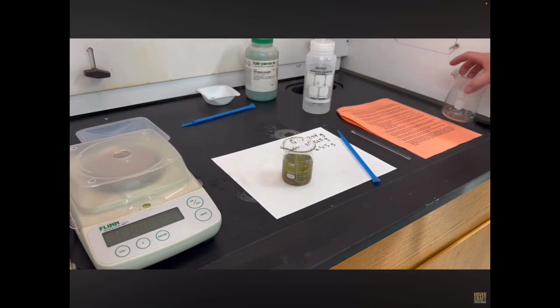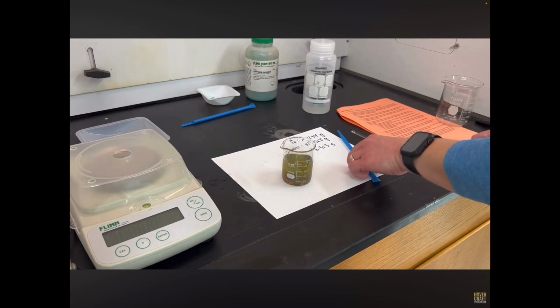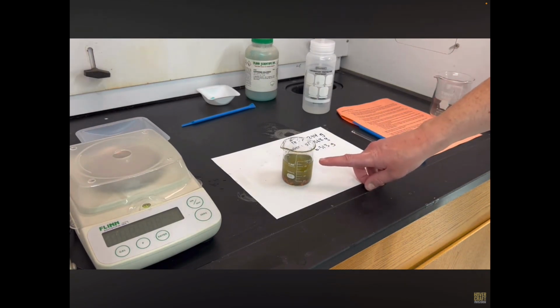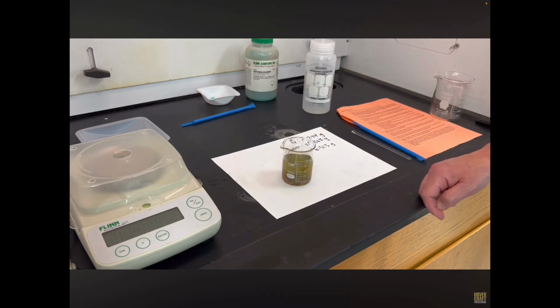Our goal for the next part of the investigation is to collect and clean the copper. We're going to use a lab technique called decanting. So the procedure says that we're going to decant the liquid, which means to pour off the liquid on the top, and rinse the copper a few times to try to clean it and rinse off any dissolved iron chloride that might be clinging to the copper.